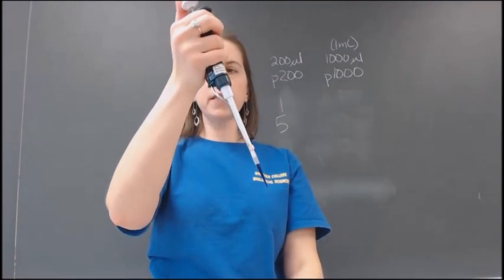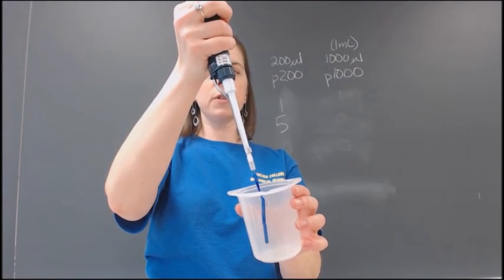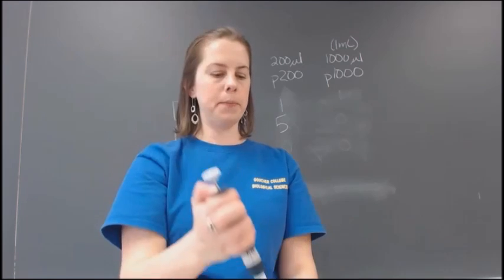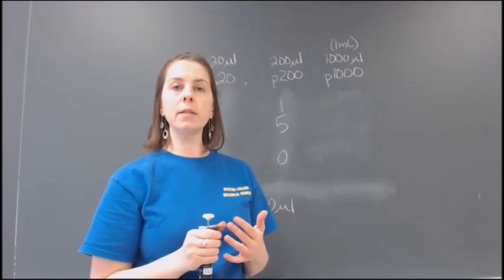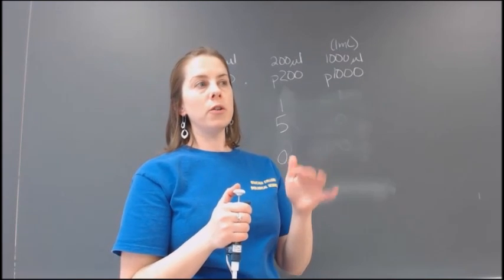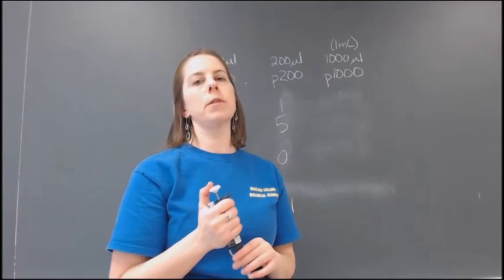And then in order to expel the liquid, I push the plunger slowly back down to the first stop and then all the way out. Okay? You'll notice that some liquids are quite viscous and you'll need to raise the plunger especially slowly. And also when you release the liquid out, you'll have to push the plunger back down extremely slowly.